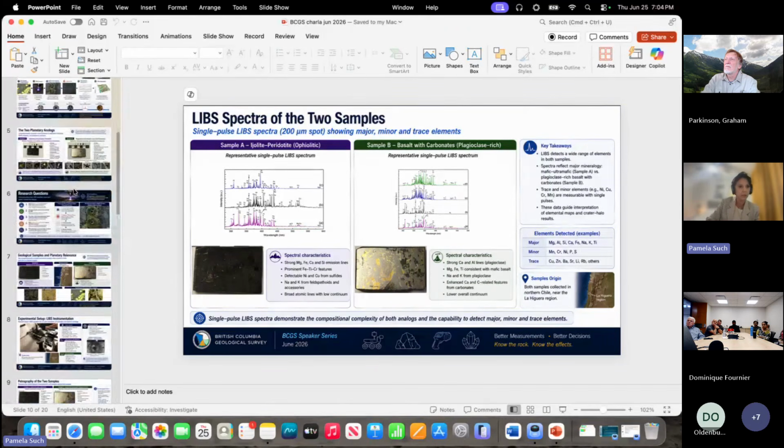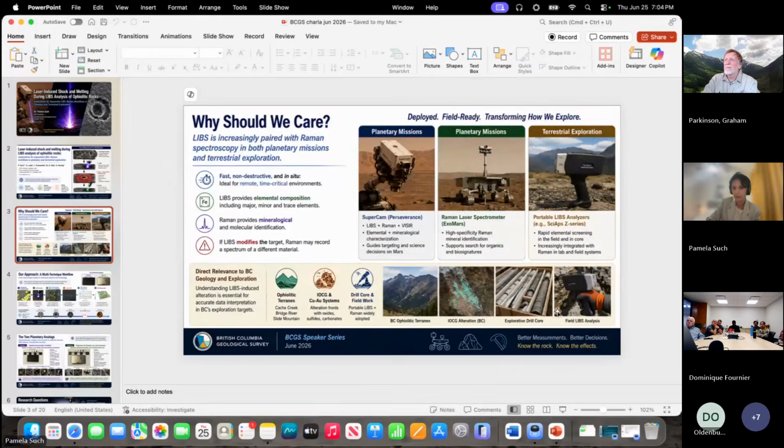I show you an image in the beginning here. This is a real one. You see the hand here? This is a LIBS. Yeah, it's very handy when you're in the field. Here as well, portable LIBS. It's very handy when you're in the field for use. Of course, when you're in the field, you shoot a place, and then you won't shoot Raman on the same place. In our case, in our planetary missions, as we are pointing with the head of the Perseverance, we were probably shooting at the same time, the same place. So the only thing that was needed was just to change the position in the workflow where we're going to use LIBS. Okay, leave LIBS to the end, not in the beginning.